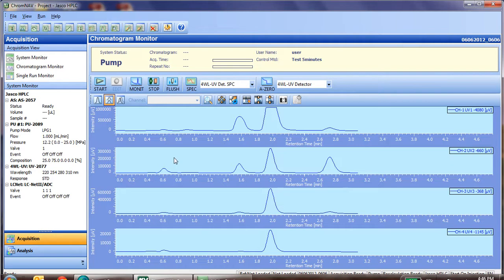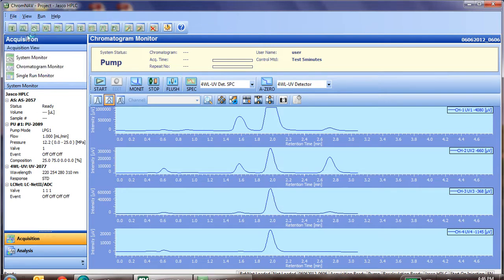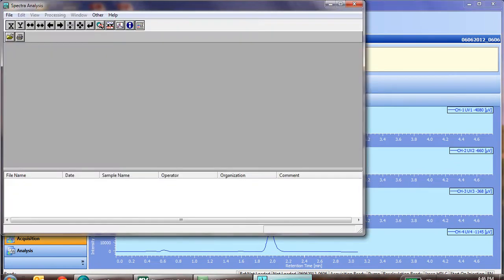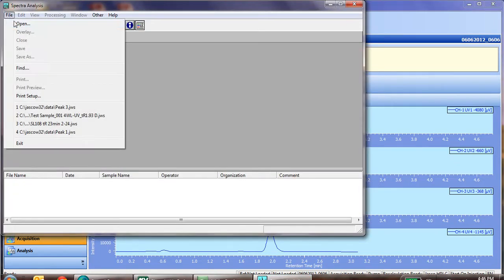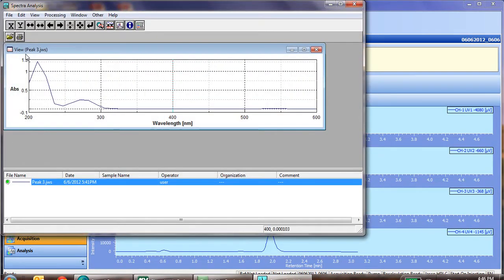But one thing first, let's go check on that spectra, and show you a little bit more. To open that spectra, go to file, and start spectra manager. You'll see that comes up, go to file, open, and then we select the peak we just ran the spectrum of.